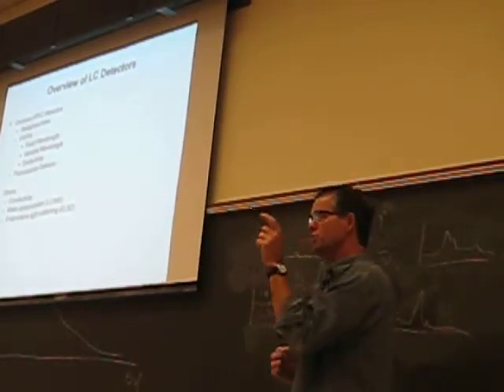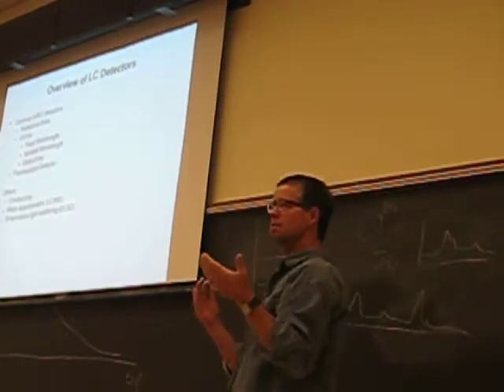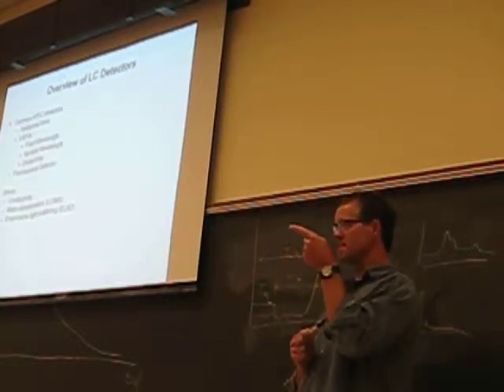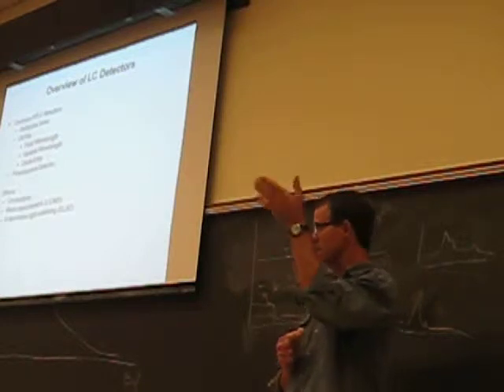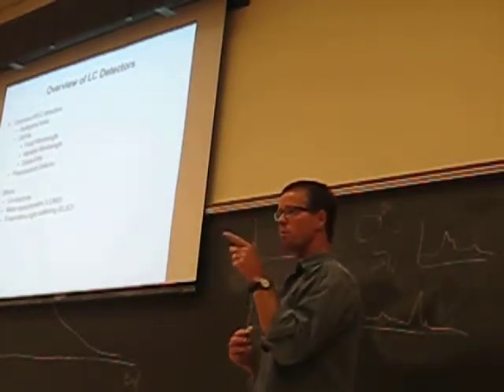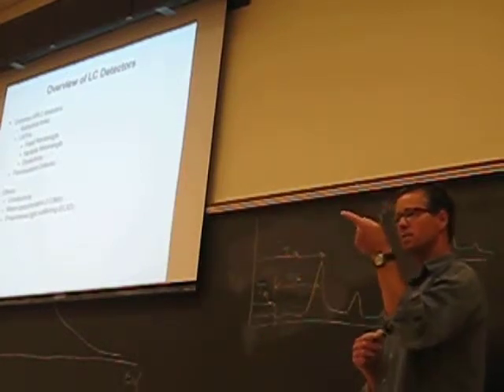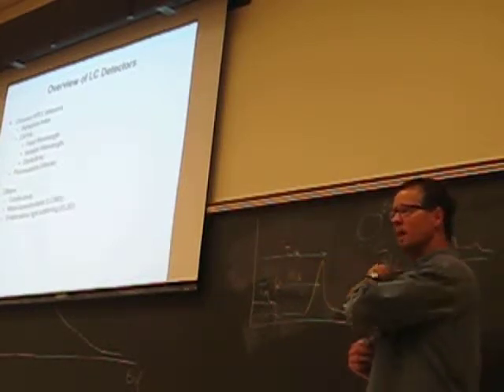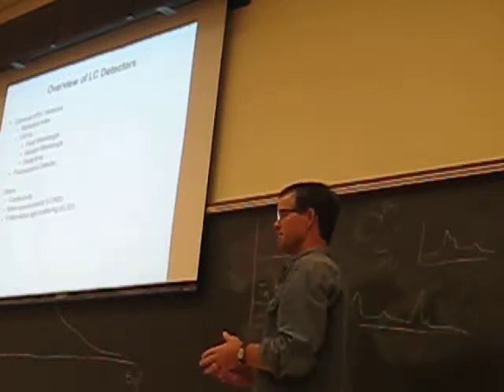So the conductivity detector is a bulk detector because it's not telling you who's conducting. It's just telling you that there are things in there that are conducting. The higher the anion content, whatever those anions are, the greater the conductance, right? And so we rely on the fact that we've separated those anions with the column to actually determine who they are based on the retention times. But the detector doesn't help us with that. It only helps us with how much conductance there is.